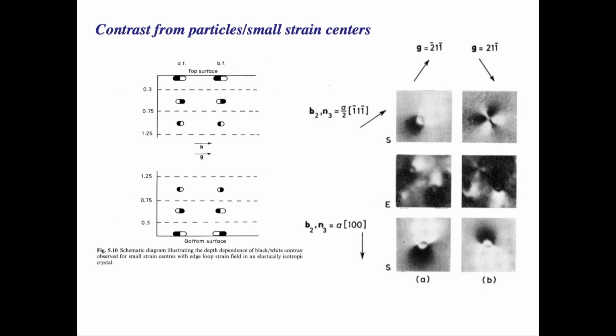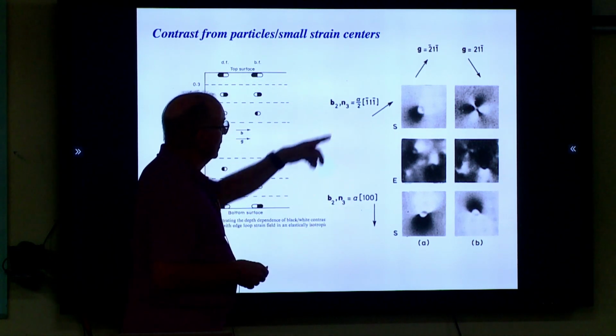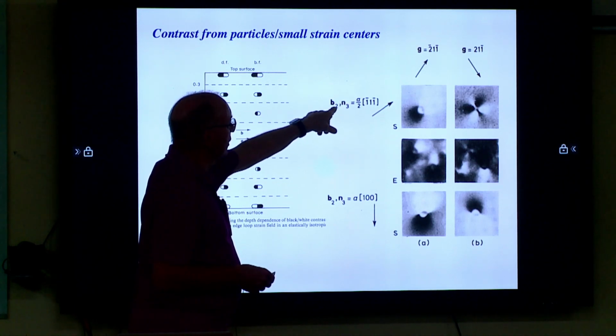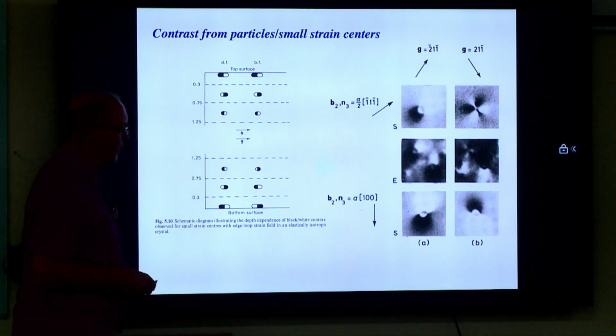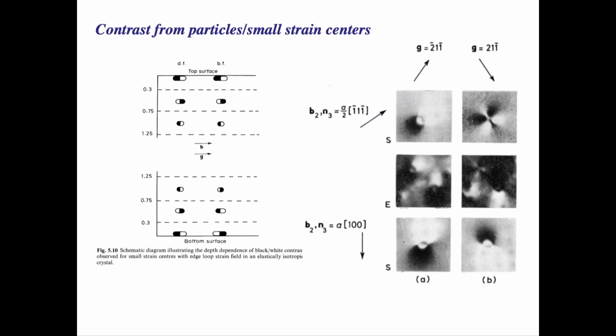This is a series then, these are all calculated images of course, and therefore different geometries of the A's and the size of the Burgers vector, and then g, the two different g's. And so by using image analysis, you can then define exactly what you have in terms of your particle. And then weak beam dark field imaging, right?